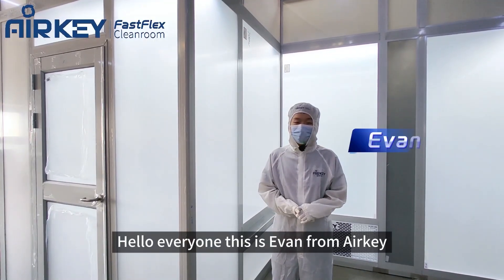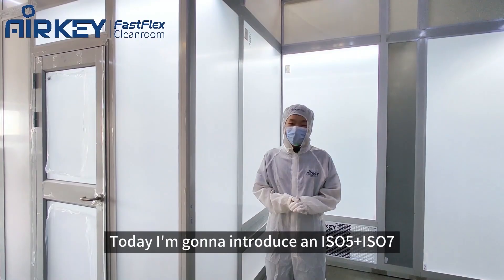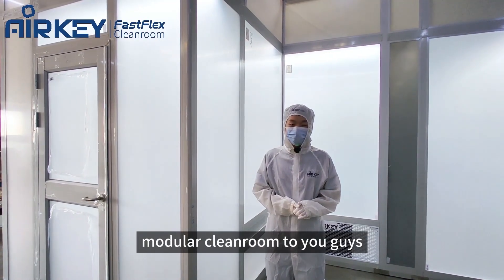Hello everyone, this is Evan from AirKit. Today I'm going to introduce an ISO 5 plus ISO 7 modular cleanroom to you guys.